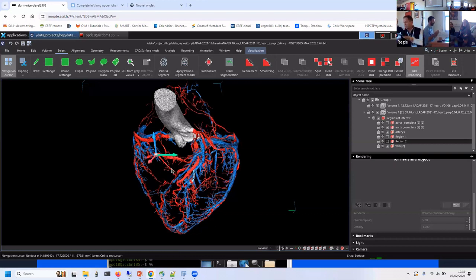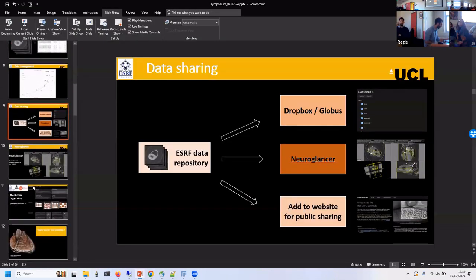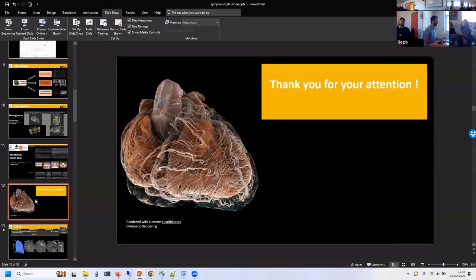But the time will depend on how precise and nice you want your segmentation, whether you just want a visualization, or something that you can quantify, do skeletonization and stuff like this. So yeah, here's a good example. And I think with this, I have presented everything. Yes, and I think I'm right on time.